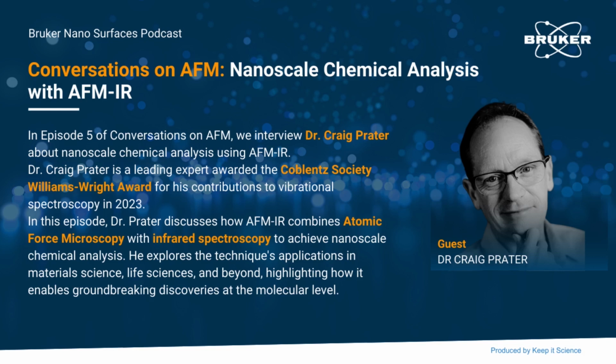And so AFM from the very early days has been very strong in different forms of multimodal imaging. So I mentioned previously, the AFM can be used for measuring things like the mechanical properties, like the elasticity or stiffness of a sample, the dissipation through phase imaging, electrical, mechanical, thermal properties, friction, et cetera.